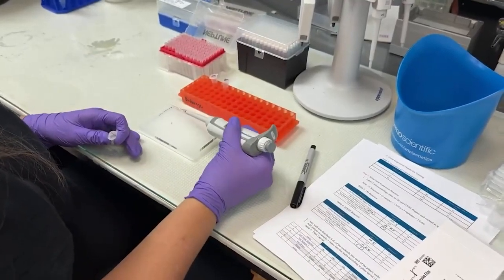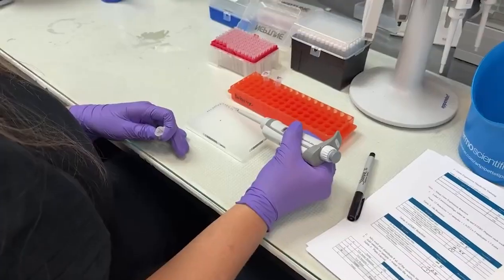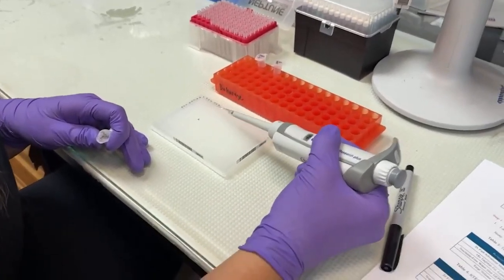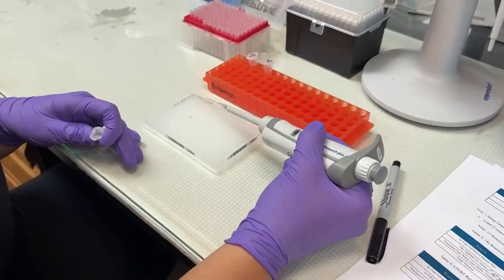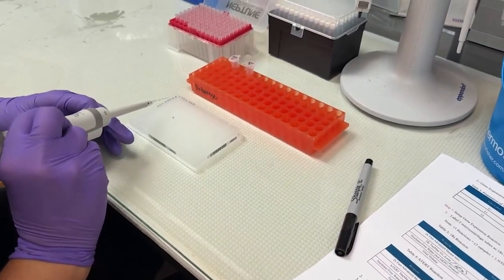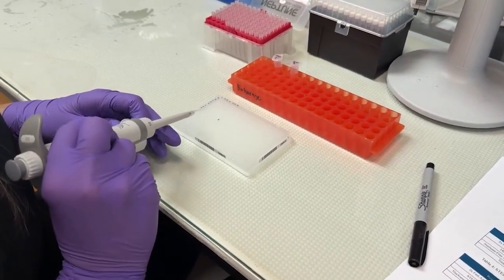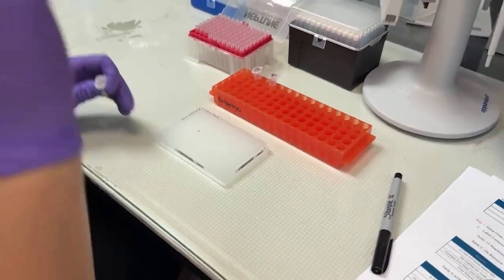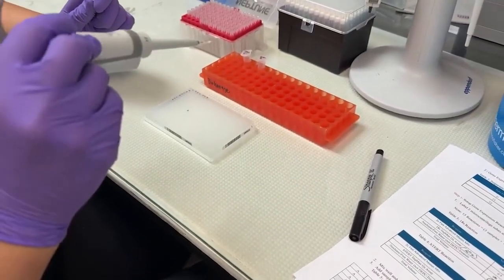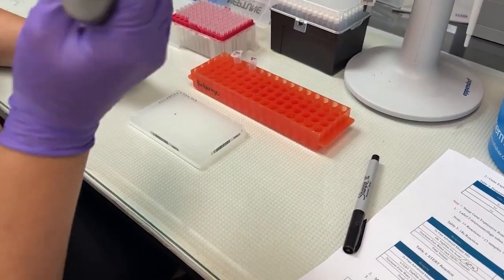Remember, I added the 18S reaction mix to columns 1, 2, 3, and I added the TERT to 5, 6, 7, and now I'm going to come back and add sample 1 in row A, sample 2 in C, sample 3 in E, and my no template control in G. So if we work out the rest of that matrix, I'll have triplicates represented for each of the 2 tests for each of the 4 samples.